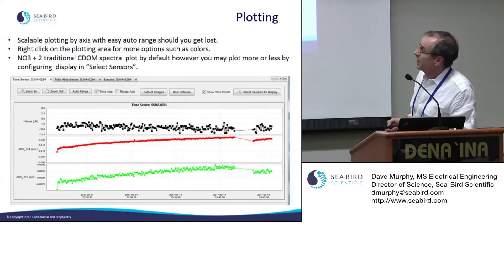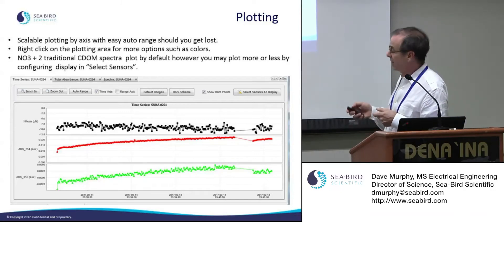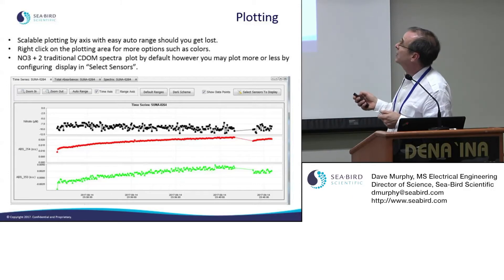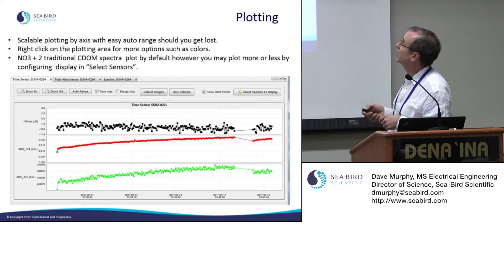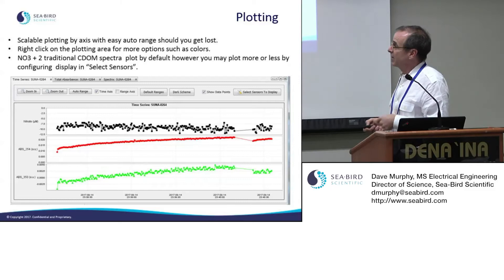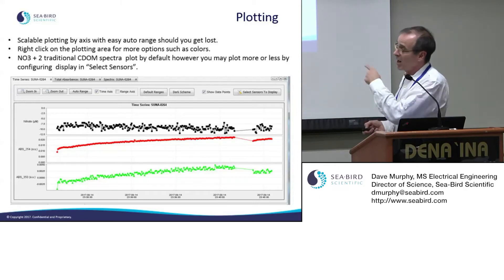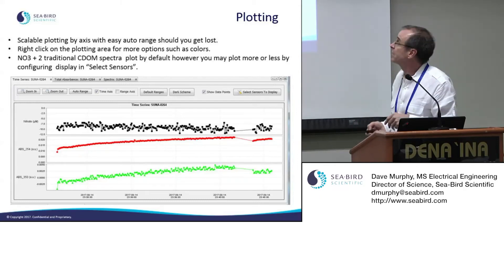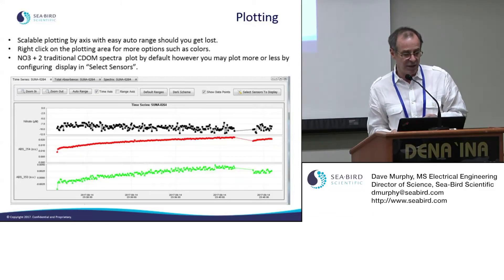There's also an offset value indicating where the spectrum starts — whether at 206 or 208 nm — supplied with the spectrophotometer and visible in the log files. In the spectral display you can zoom in or out, use auto-range to snap the view back, switch between time and range axes, and toggle between a white or dark background. You can also elect to show just lines or individual data points.